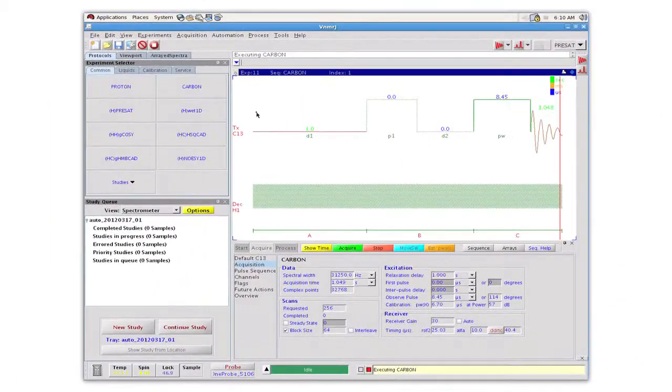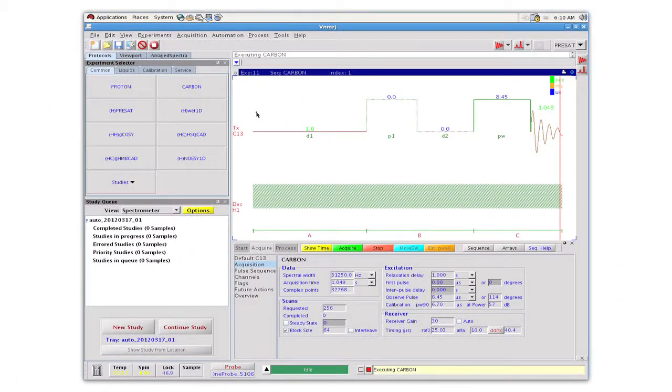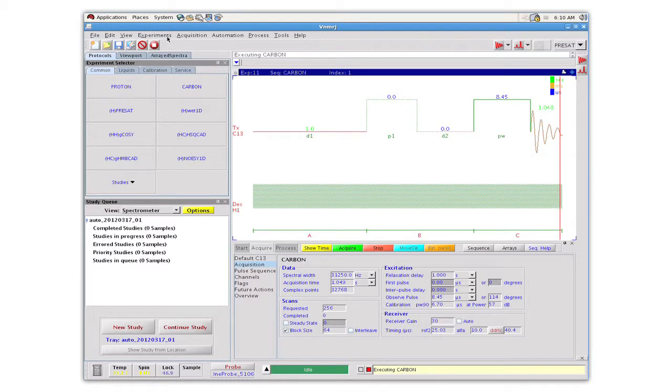We are using a 500 MHz DD2 spectrometer equipped with a 1NMR probe. A vinyl decaborane sample has been placed into the magnet, it is locked and shimmed, and the probe is tuned to the respective B11 and proton frequencies.